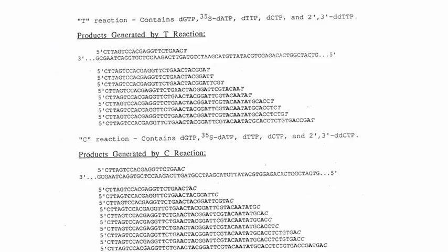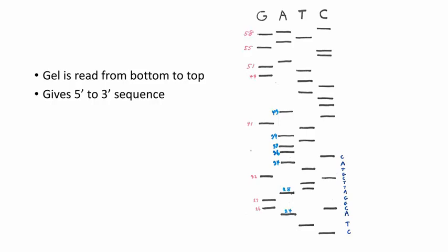Then you're going to do the same thing for the T and the C reaction. The T reaction has the dideoxy T's. The C reaction has the dideoxy C's. And when you run all of those on the gel, you're going to see the same thing.